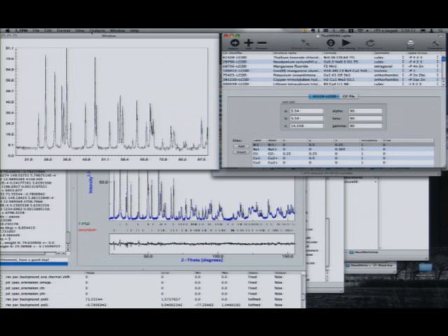Actually, here, if you go with 100,000 phases, it takes a little bit of time. So you need a multi-core machine. I run on my desktop, which has 12 cores, 24 threads, and if I use the full database, it ran in less than 20 minutes.